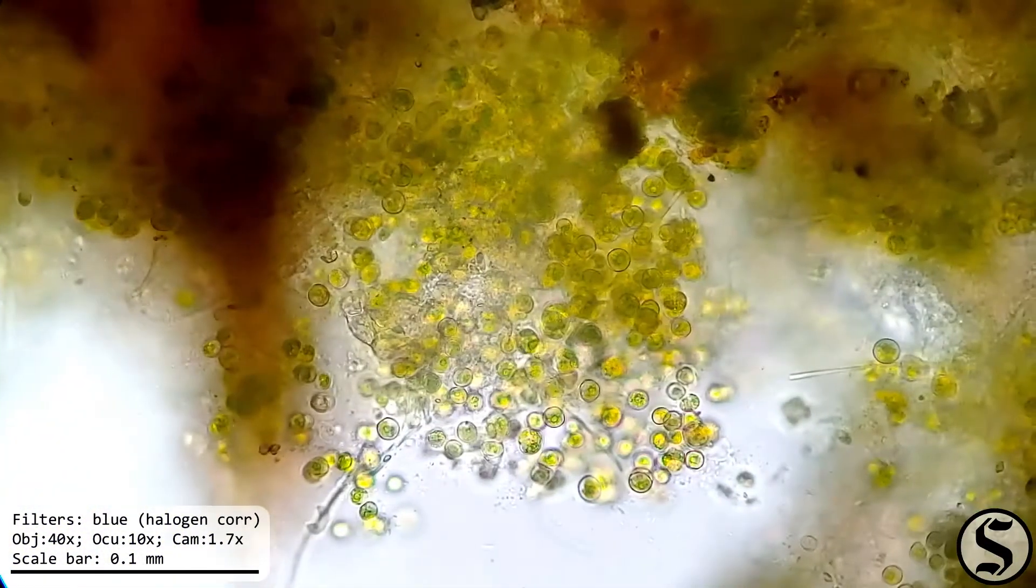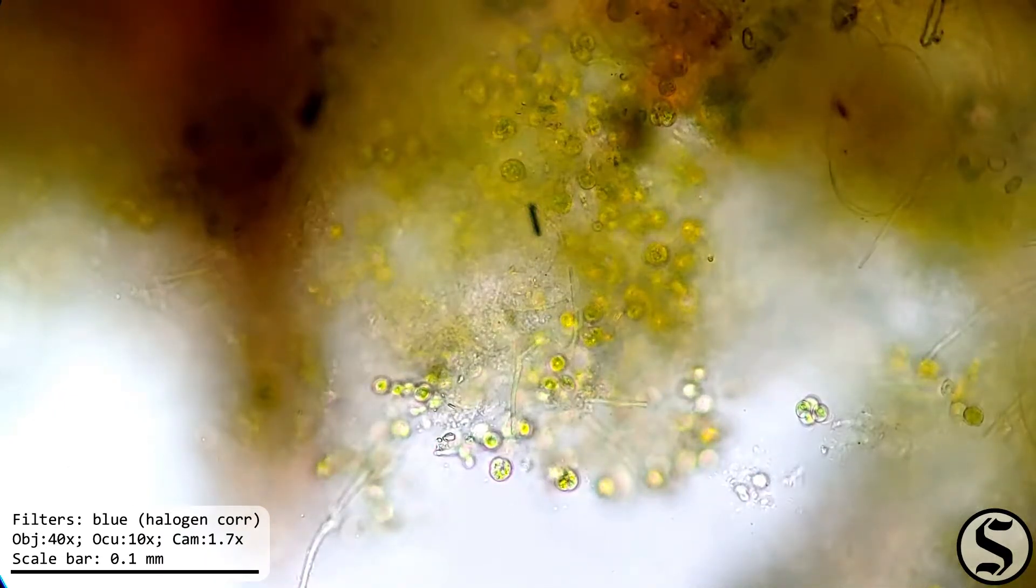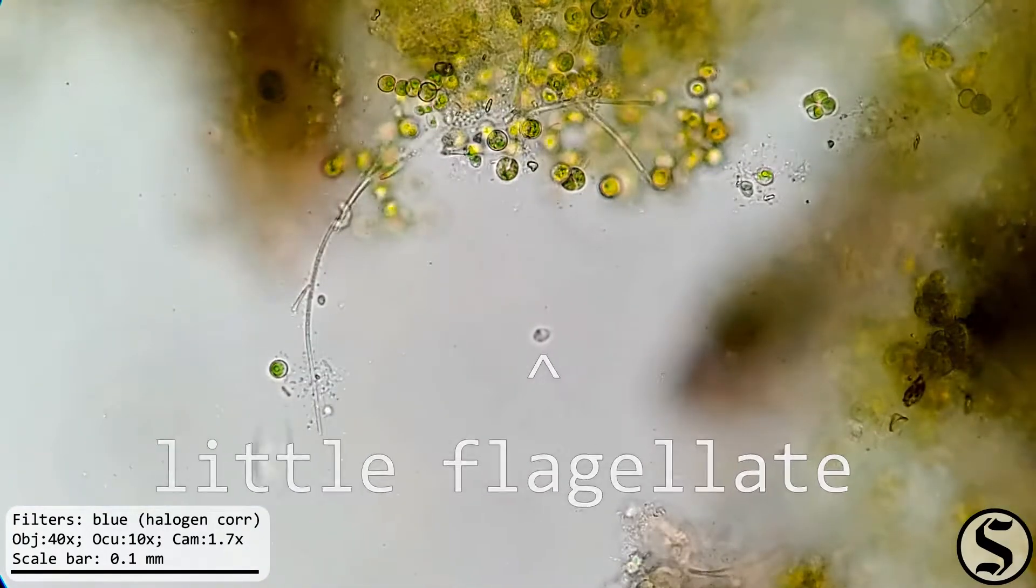Well, to answer our question of what that stuff was floating around, this looks like a green algae of the genus Chlorophyta. And they're just sort of clumped together in here.